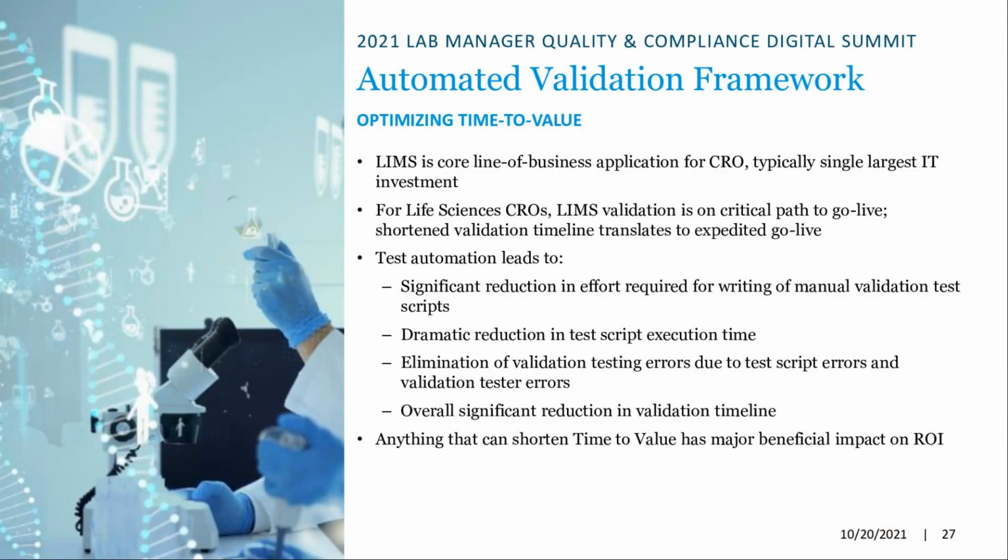And lastly, I'm going to talk about a buzzword, and if you're delivering IT solutions, this is the time to value, optimizing time to value. For vendors who are pushing cloud solutions, this is one of their big pitches. We're not talking much about the cloud offering from STARLIMS in this presentation, but it's something that can dramatically reduce the timeline up front to get a system live. And of course, one of the big selling points is time to value.